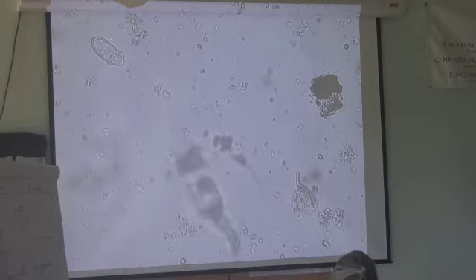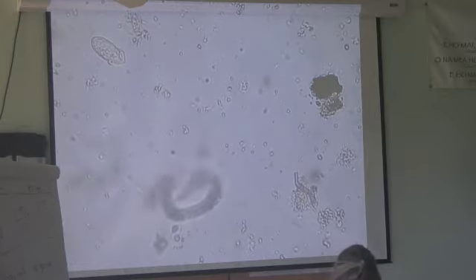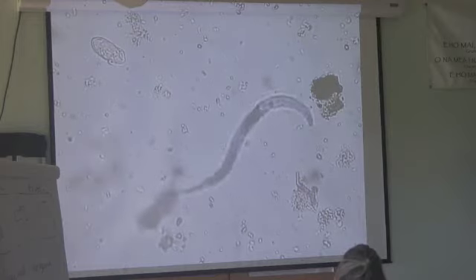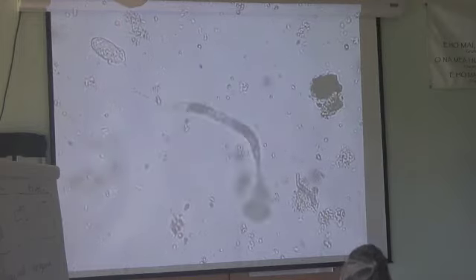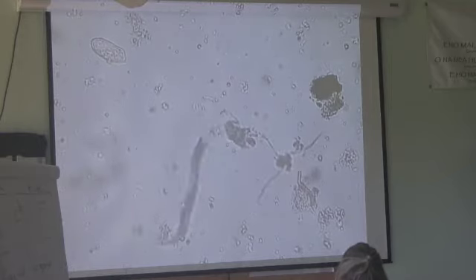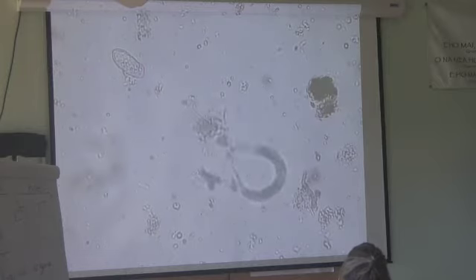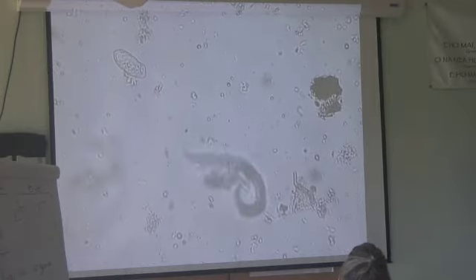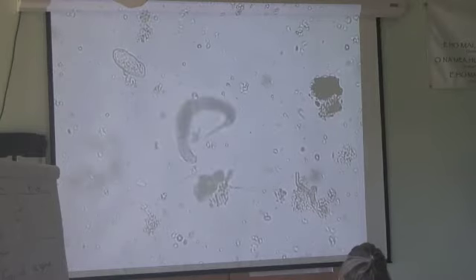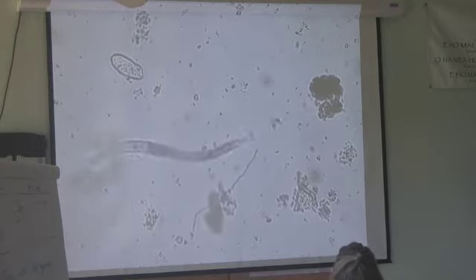This is a testate amoeba. And inside where you see all of that cytoplasm material, there's the amoeba in there. Now we just finished shaking him up. His whole world has been going swash, swash, swash. So he has retreated inside that test, inside his shell that he built, because it's just too scary to be out and active in the soil right now. So he's hiding out back in here, with a little bit of bacterial material in to protect him. Every time that nematode hits him, he's going, wow, scary things out there. I'm not going to go outside for a long time. So we're looking at this. It's in a bacteria. So we got actino in that sample.